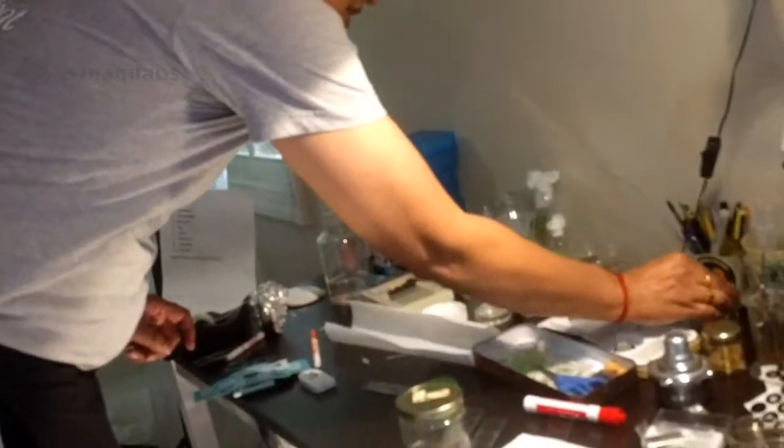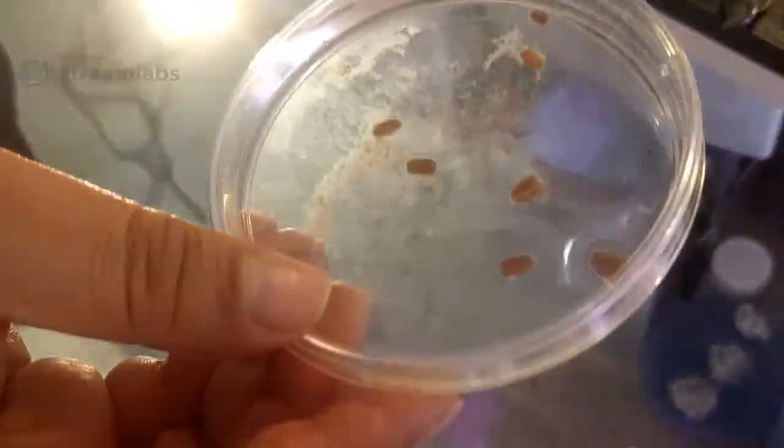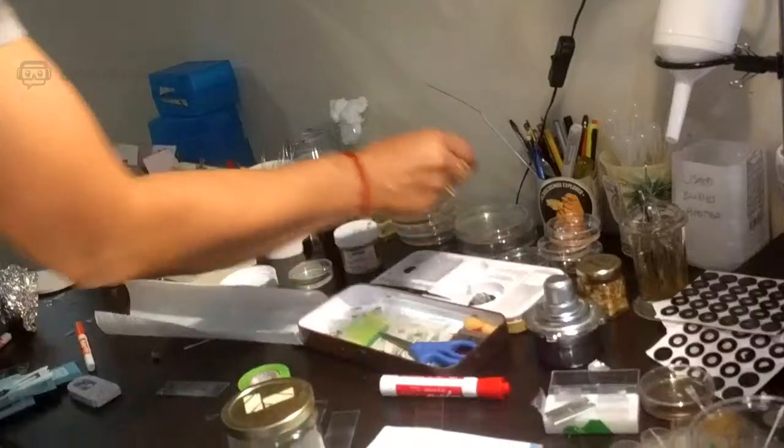If you look at my cultures, let me show you some things that I might have. There you go. Look at this. Here's a culture of something I've been growing. No name. I don't know what it is yet. But you see these little wheat grains and water? Yes. You leave your sample in that for a few days. Maybe a week, maybe 2 weeks. And magic happens. Look at it every day if you can. Look at it every 2 days if possible. And you will see a variety of life forms coming up, right?